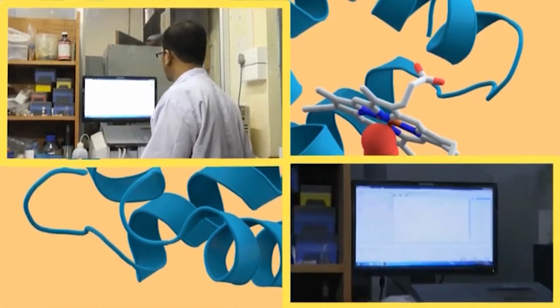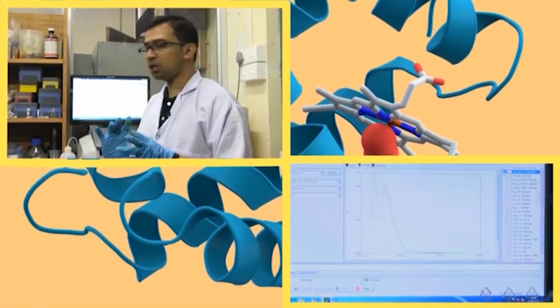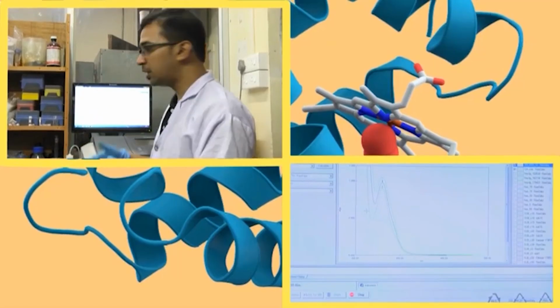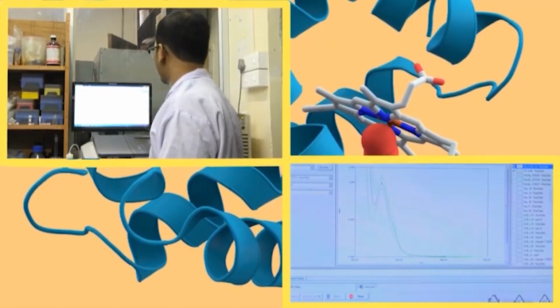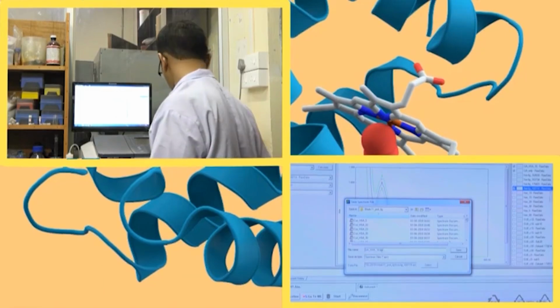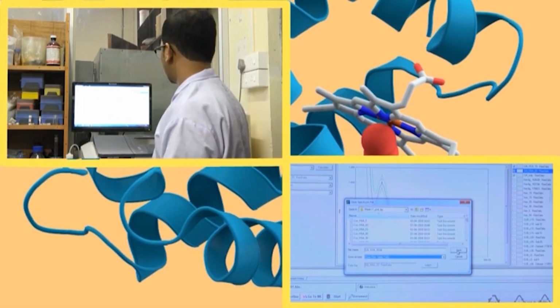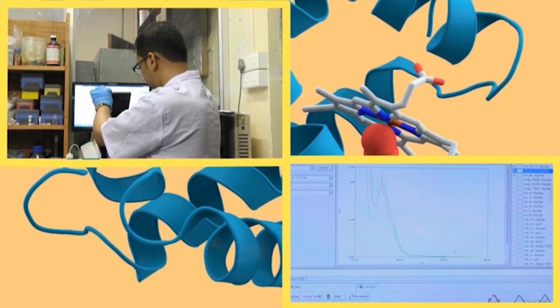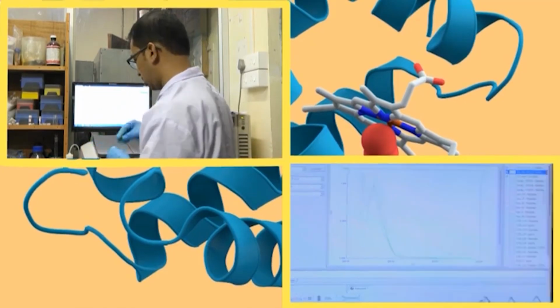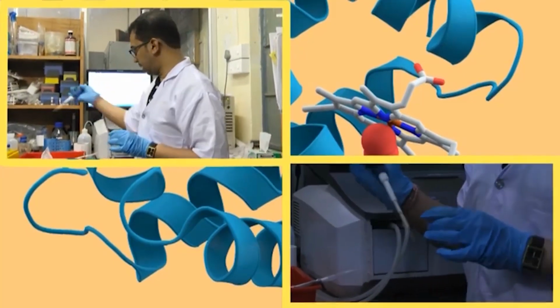So, again here we can see it is increasing. What happens basically is that there is an overlap region. As we are increasing the concentration of HSA, its absorbance also increases. Now, we are saving this one as gallic acid HSA 20. Okay. After that, to it I will be adding another 10 microliter, so it will be 30.